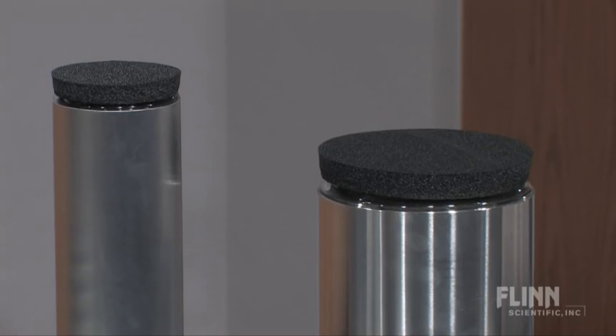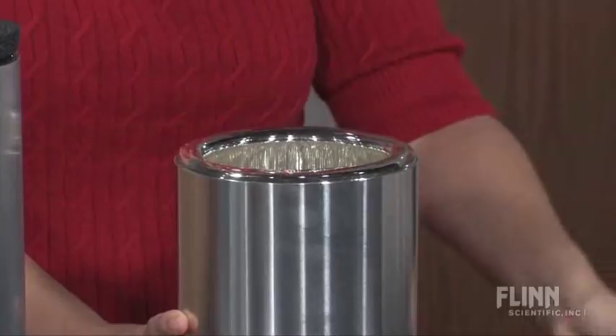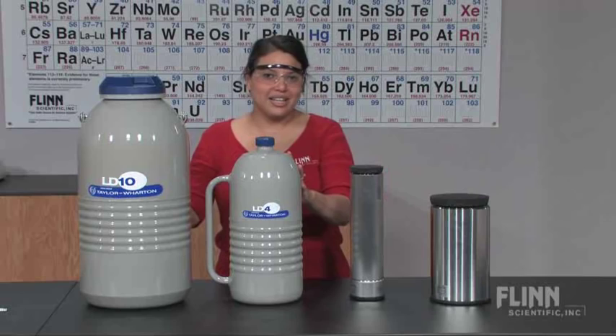Flint Scientific carries small Dewar flasks for dispensing one to two liters of liquid nitrogen. These can be safely gripped with both hands and allow you to dispense the liquid nitrogen slowly. The Dewars are manufactured from borosilicate glass, heavily insulated, and wrapped with an exterior aluminum metal housing that extends almost to the top rim of the flask for extra safety protection.